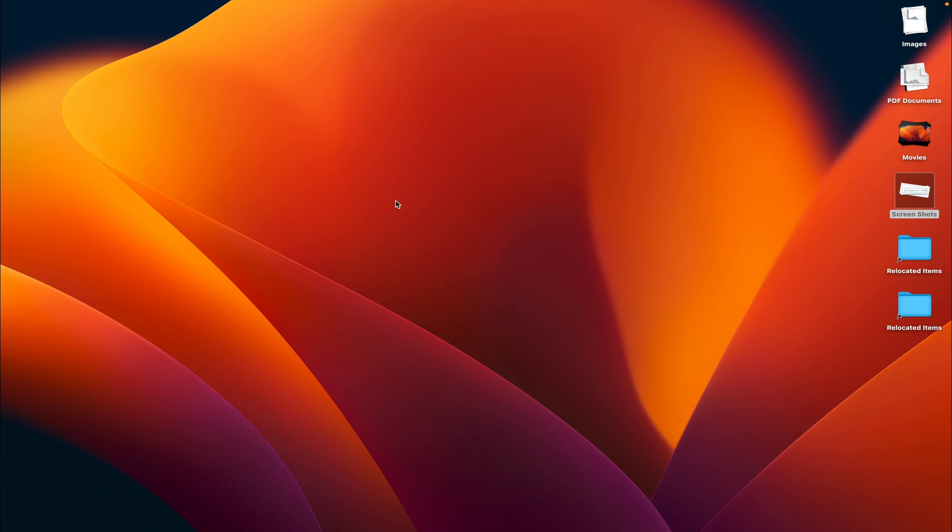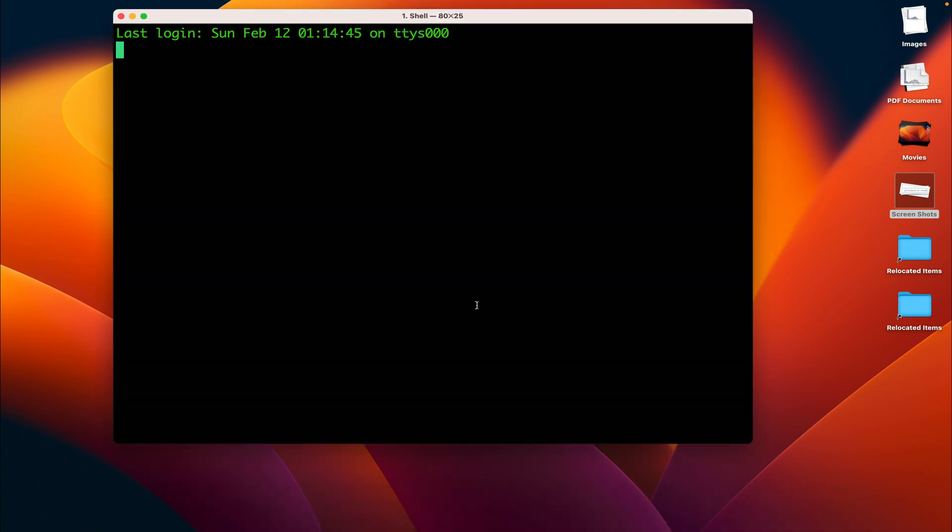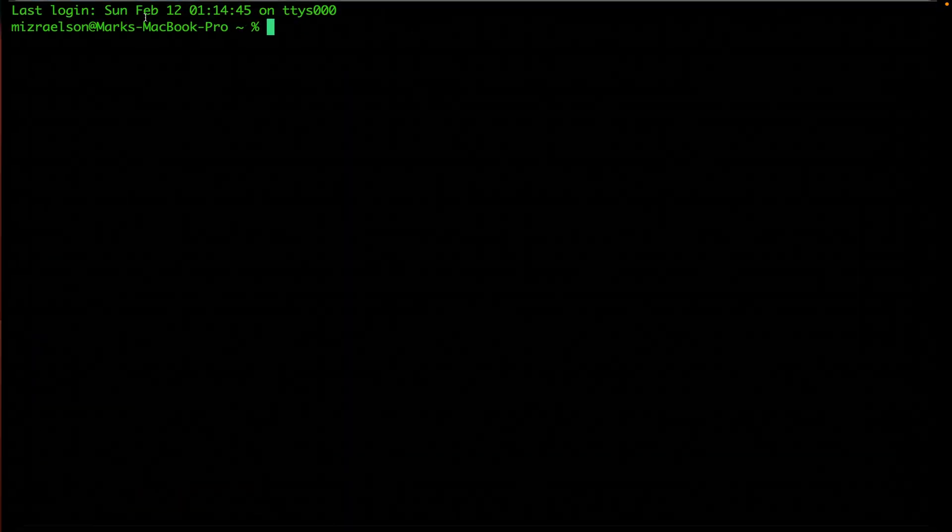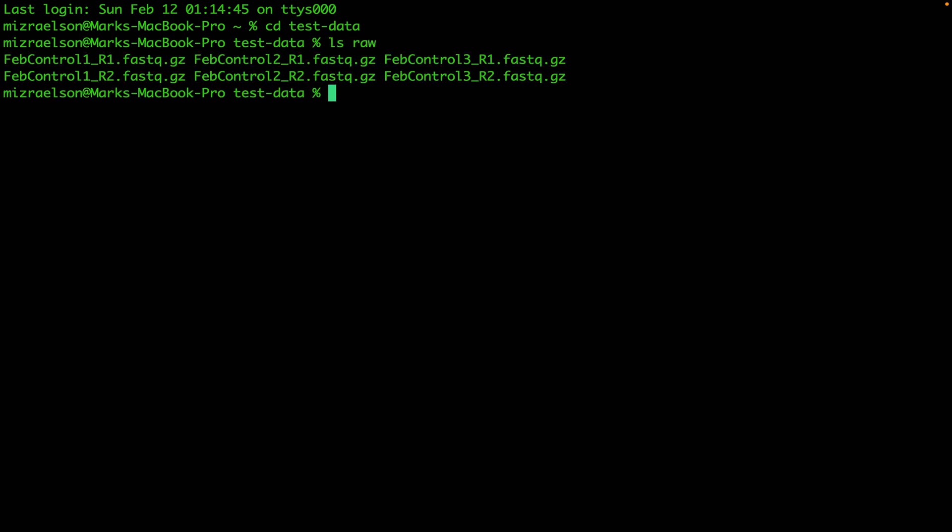Hi, today I'm going to show you how to analyze your data if you have multiple samples. We're going to start with opening the terminal window and I'm going to go to the directory called test data. Inside this directory I have a raw folder with three samples. Each sample consists of a pair of FASTQ files.